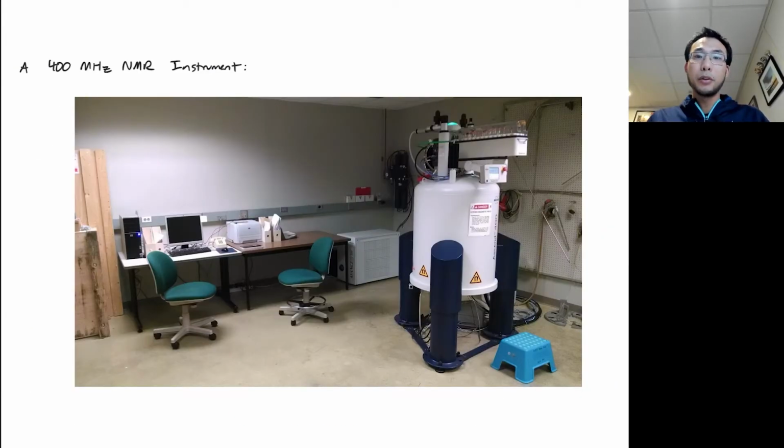Here I'd like to show you what an NMR instrument actually looks like. This is the Macalester College NMR instrument. It's a 400 megahertz NMR.